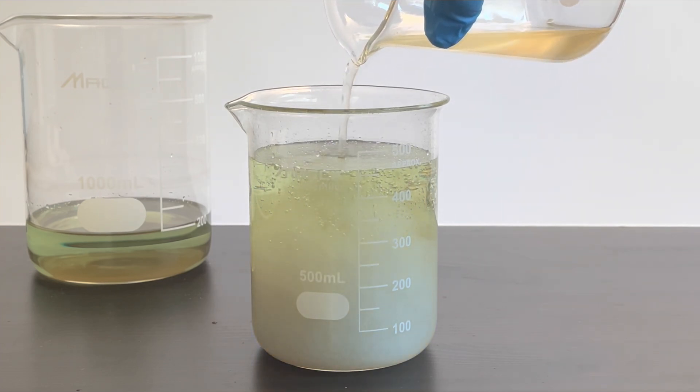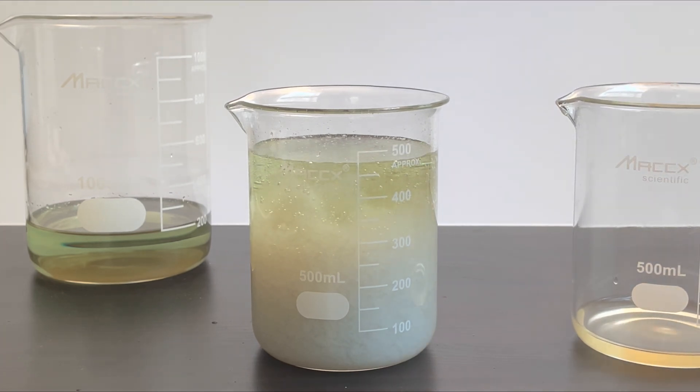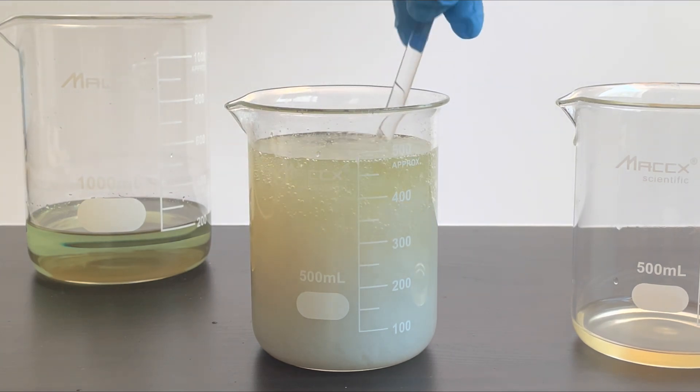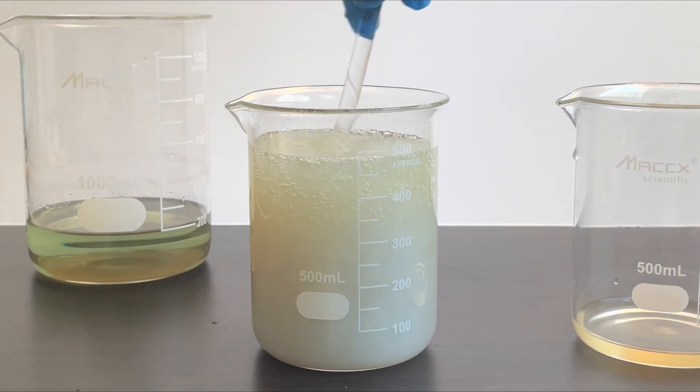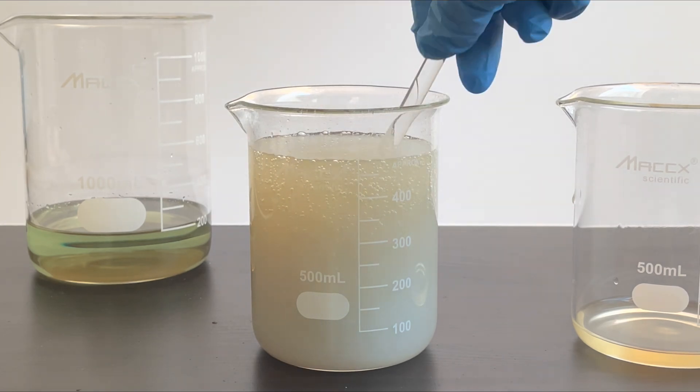Oh yeah, now that is a really cool precipitate. I don't know what it is, but I find it pretty cool.